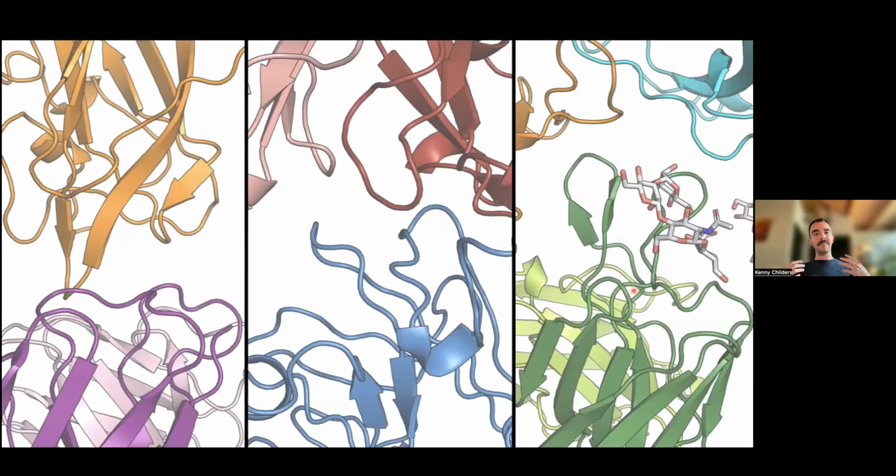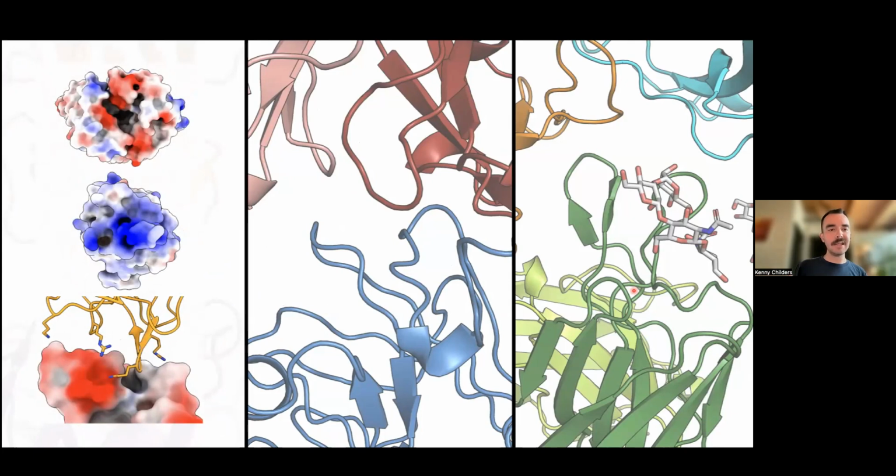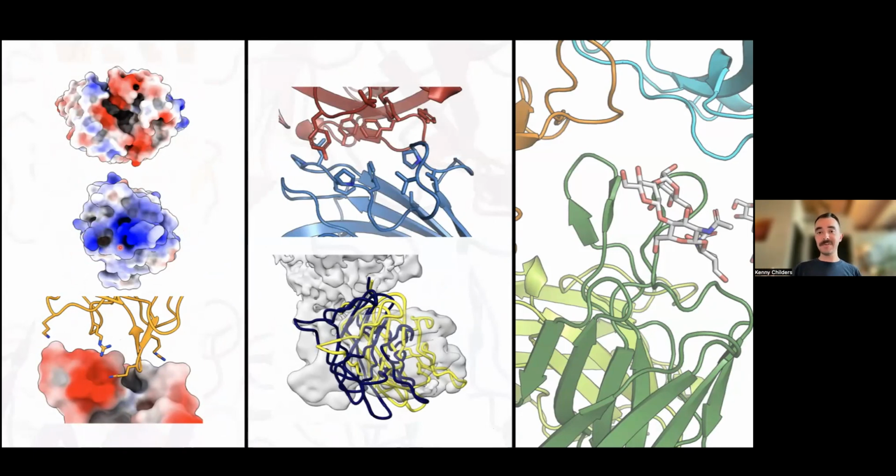So hopefully what I've shown you today is really the benefit of cryo-EM for our research and how it's really been a catalyst toward furthering our understanding of the immune response to factor VIII. We were able to look at the electrostatics between one antibody, NB33, which uses this negatively charged cleft to target positively charged residues on the C1 domain. We were able to report on the first structure of factor VIII bound to an A2 domain inhibitor.